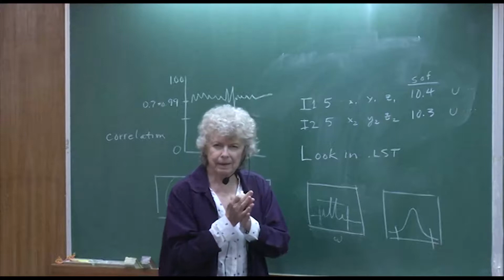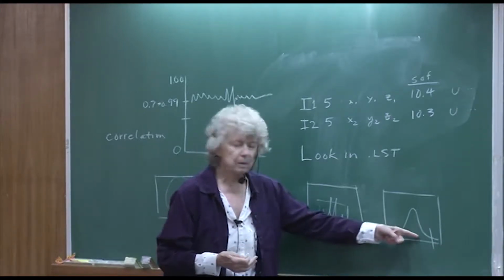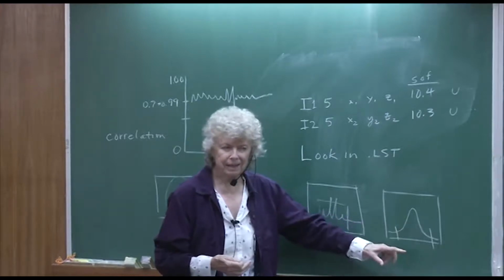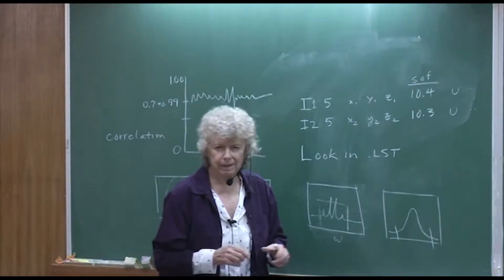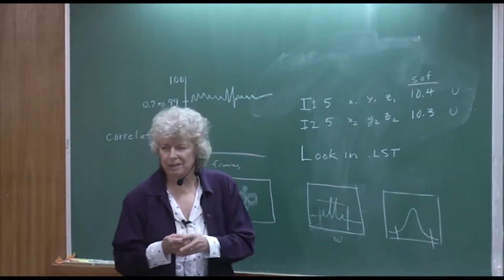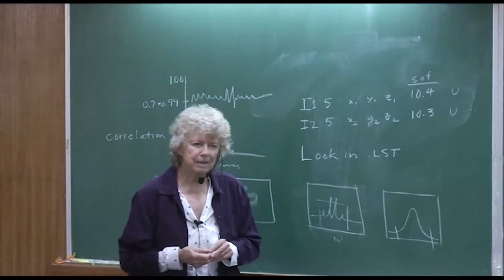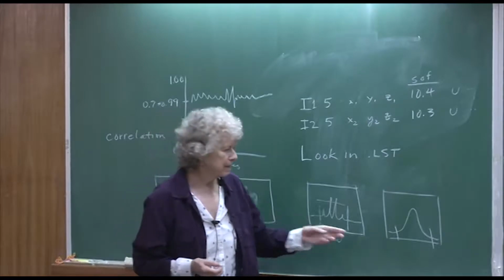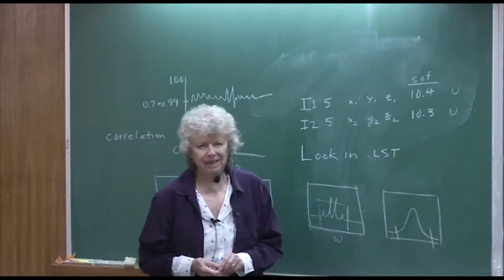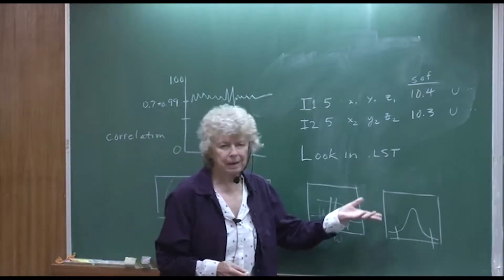But in that case, I think it's better to use the same box size all the way through. So you can adjust it to a larger size and fix it, and that will also make things go faster, because all along as it's doing the integration, it's trying to adjust the box size. That was the way the algorithm was set. But in the beginning, when they first came out with the area detectors, the user had to fix the box size. It wasn't adjusted automatically. Anyway, you can try both ways.